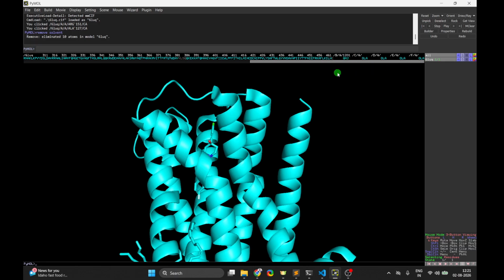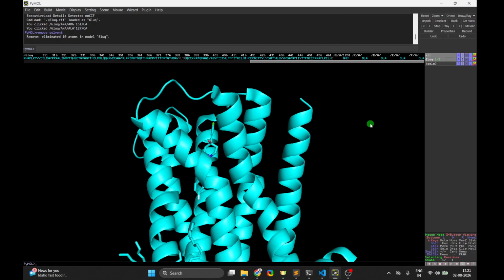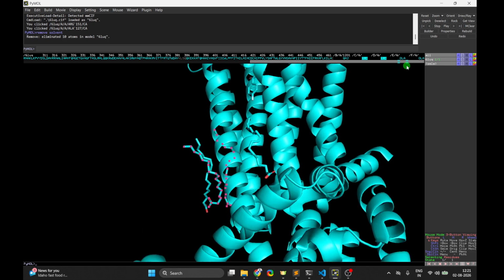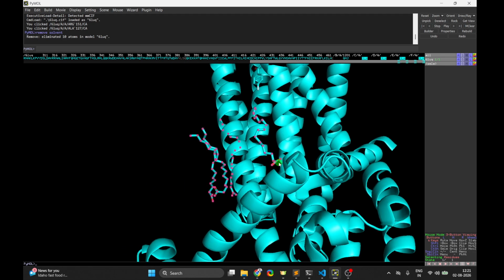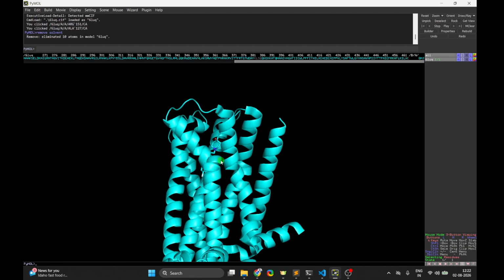So as you can see right over here, the first one is the ligand molecule. If I click on that one, you will immediately see it got selected. So that I want to keep. But there are these additional molecules that are also present. I'm going to select all of them and just remove them. I really don't want these molecules. These are probably coming from the crystal structure when it got crystallized, or I don't want to show them. Then I'll just remove these from this particular structure by going to remove atoms, and as you can see, they are gone. Okay, wonderful.